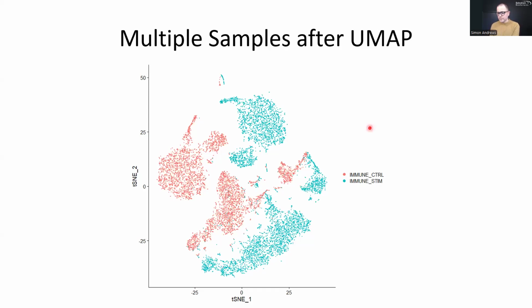So when we're looking at this data, normally our workflow would be to try and identify cells of equivalent cell type, and we would do that across all of the different samples that we were looking at. In order to do that, we would want them to sit on top of each other in a t-SNE or UMAP spread. If we look at it here, we can see that there is no overlap really between the blue and the red. But if we look, we can pretty much see where the structure should be.